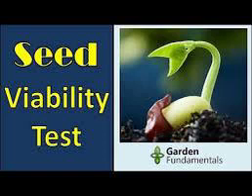Staining of seed: it is done by soaking seed in tetrazolium solution for a specific period of time to allow staining of viable tissues in the seed. Tetrazolium is used directly as a 0.1 or 0.5 or 1.0% solution at 33 to 35 degrees Celsius temperature for 24 or 48 hours at pH of 6 to 8. Evaluation: seed is evaluated according to staining pattern.